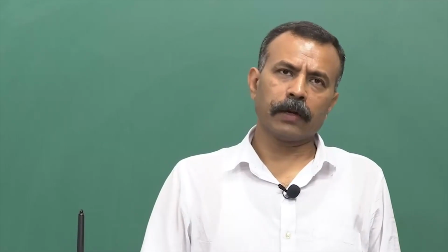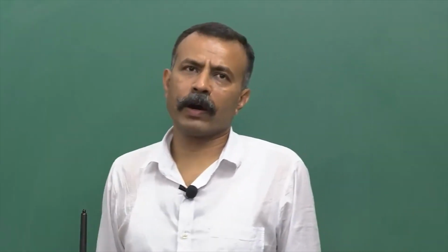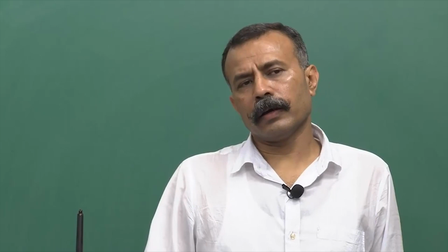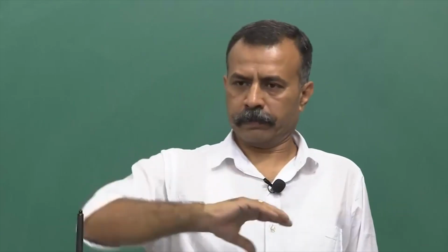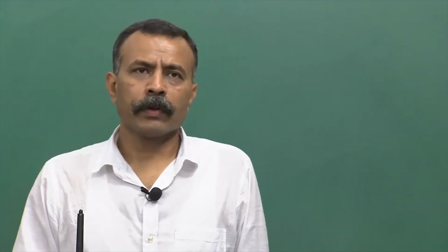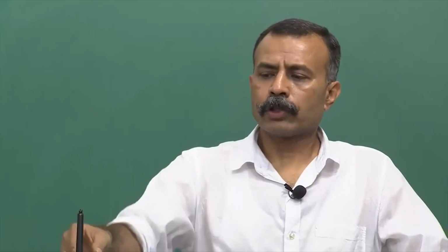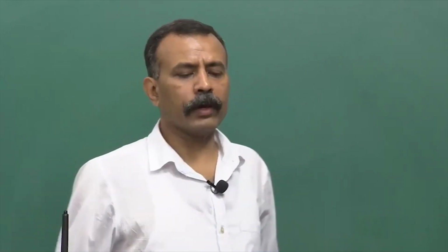While talking about it, I highlighted the first point: what is the objective of setting up the lab, what kind of experiments will be conducted in that lab, and what is the next 5-year or 10-year plan down the road, how the lab will expand, and what new aspects have to be added. Based on that, the layout design should be planned.